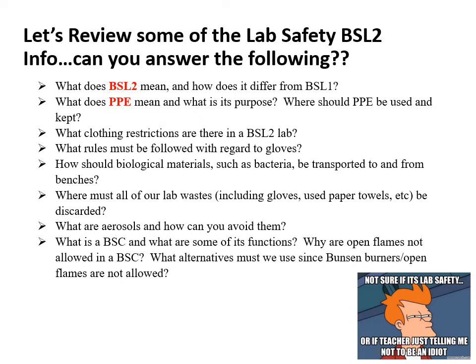Now, the first thing we're going to start off with today is the idea of lab safety, which is very important for a microbiology lab because this course is a BSL2 lab. Okay, so I want you to circle, star, highlight the term BSL2. Okay, we're going to go through in the coming slides what that actually means.